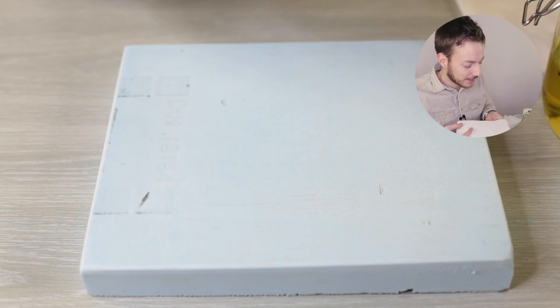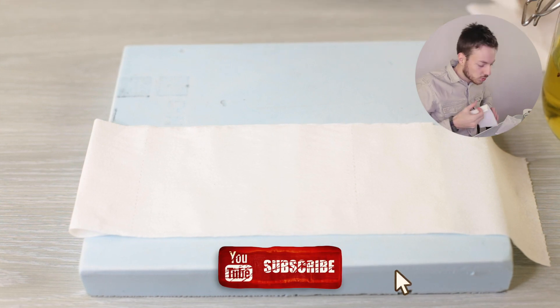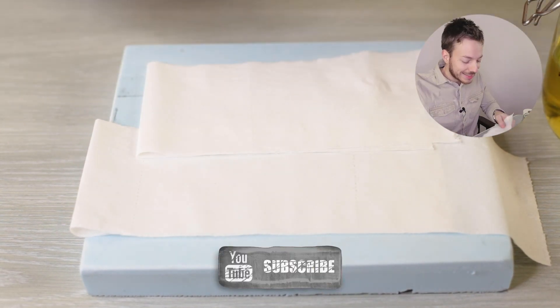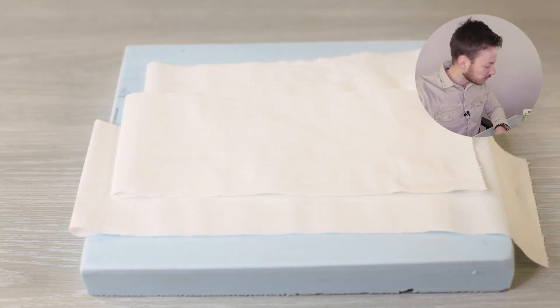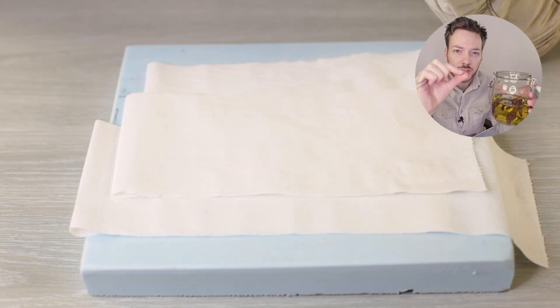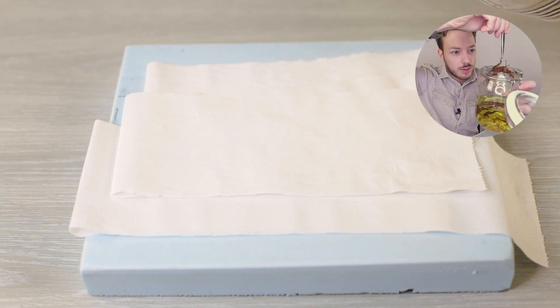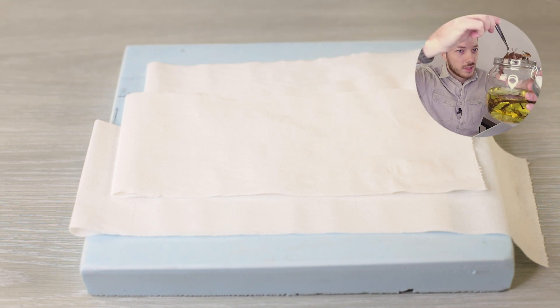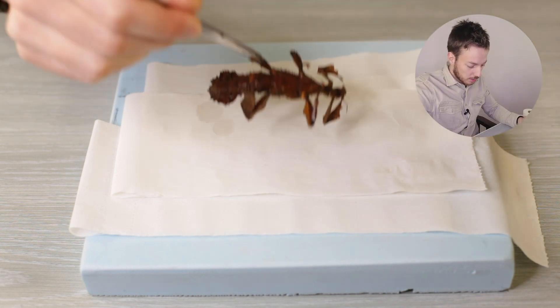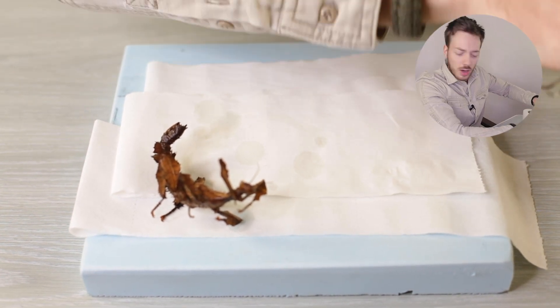So first, opening the bottle — it's probably gonna smell a little bit. Yep, that's definitely alcohol. Before I take these insects out, I'm first putting some toilet paper on the foam, just to make sure that all the alcohol still in the body doesn't completely soak the foam first. Then it's time to take the insects out of the alcohol, and I use one of my pincers just to make sure my fingers don't have to touch the alcohol. I grab hold of one of the legs, pull it out, let it drip a little, and put it on the toilet paper.